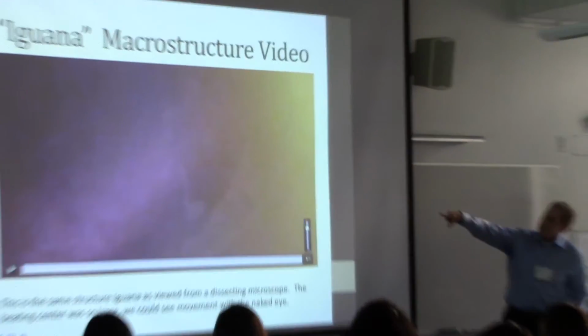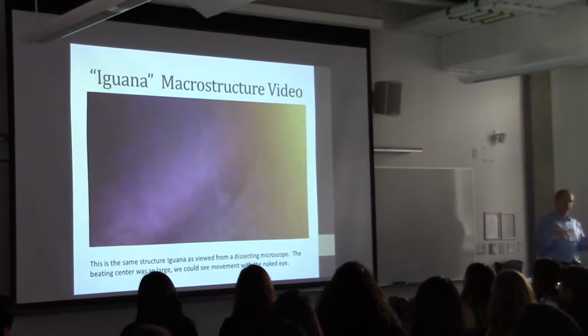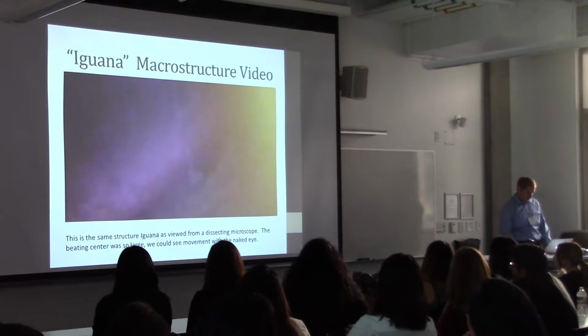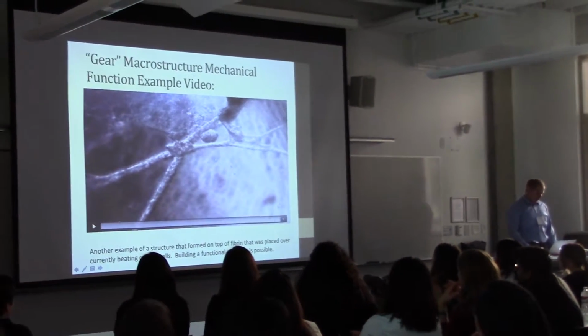So on this plate, you can actually see that was beating. That's taken from a dissection microscope, not a regular microscope that we use. And this is an example of gear.